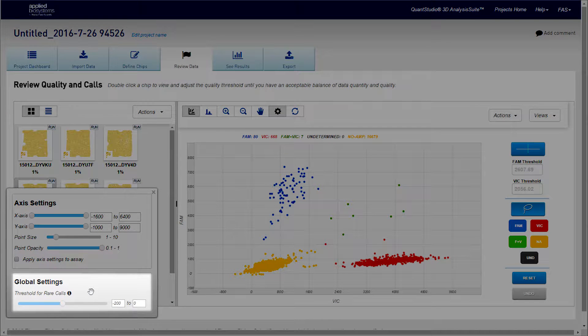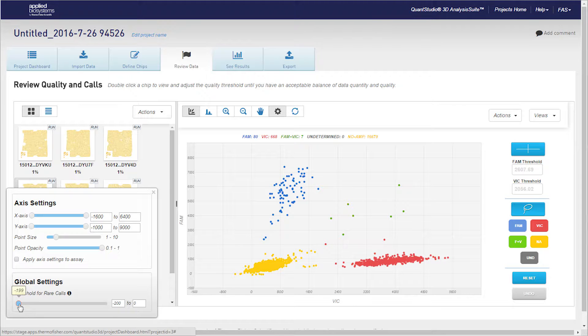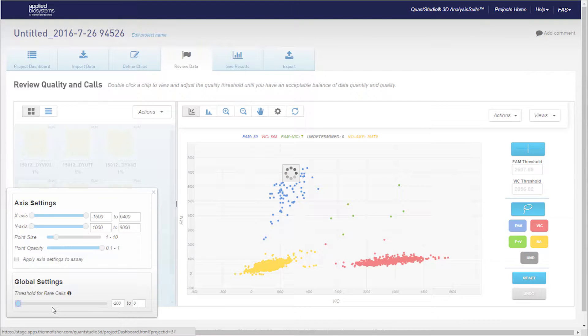Notice the new Global Settings slider bar at the bottom of the dialog window. This threshold represents the probability that a given point is part of the non-amplification or wild type clusters.